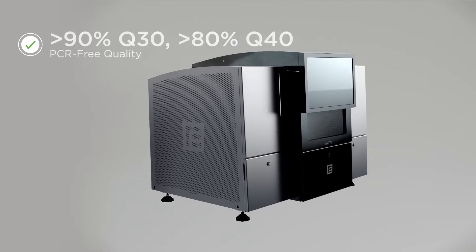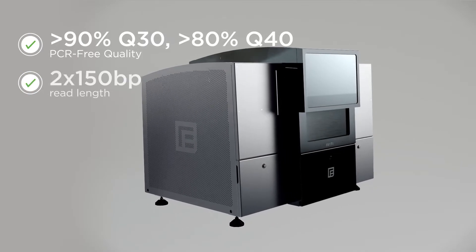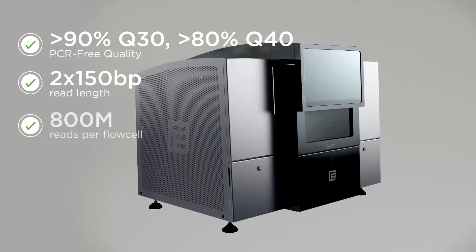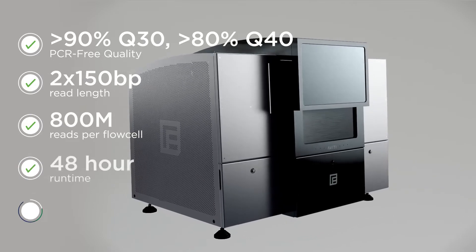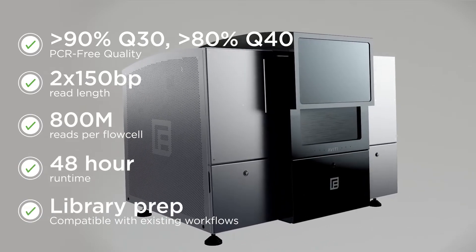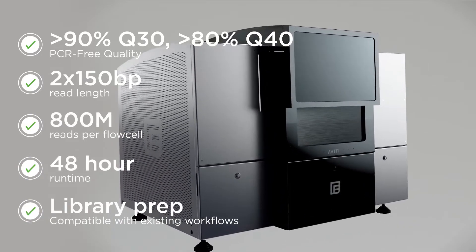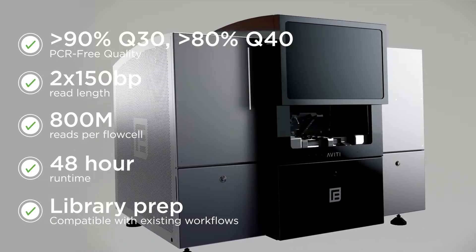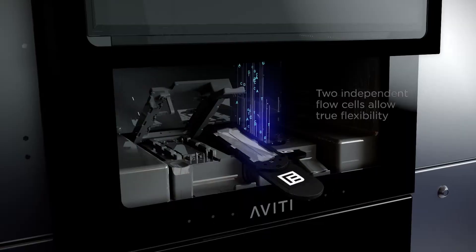All the elements of a sequencing platform reimagined. Aviti combines a flexible, simple workflow and best-in-class data quality on a desktop system to perform affordable genomic science at your bench.